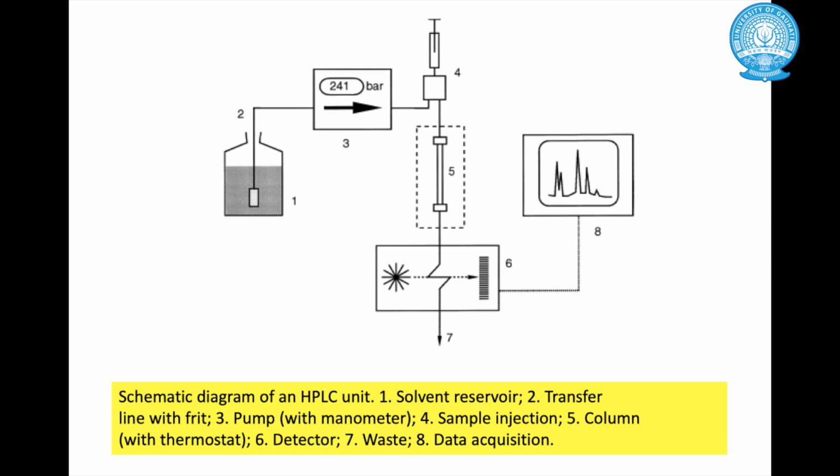So what changed this reversion or difference in the phase of stationary phases in normal and the reversed phase will bring about? One is that the mobile phase, which is used in the normal phase, is non-polar, whereas the mobile phase used in the case of reversed phase columns is polar, such as water, buffers, methanol, acetonitrile.